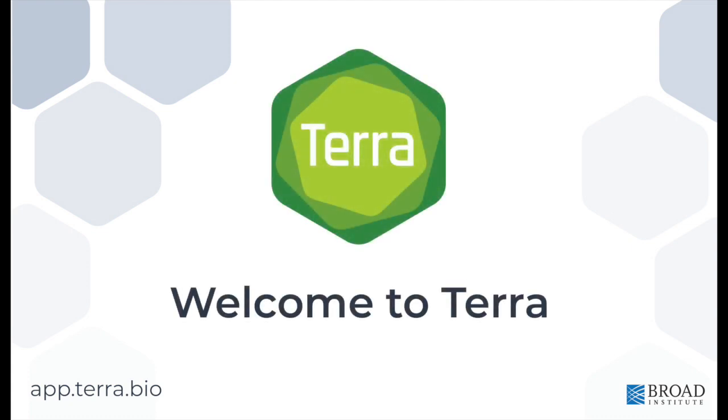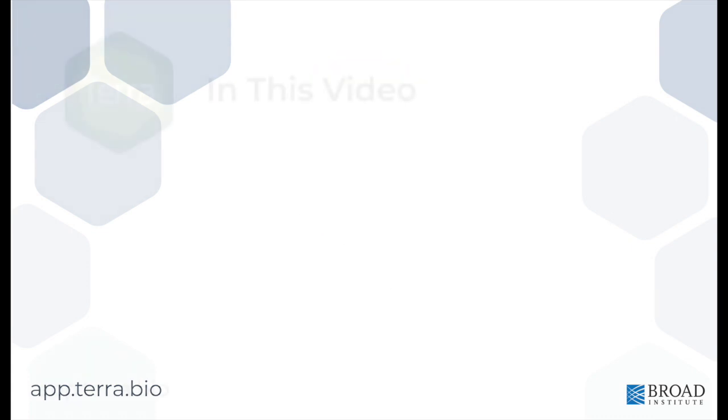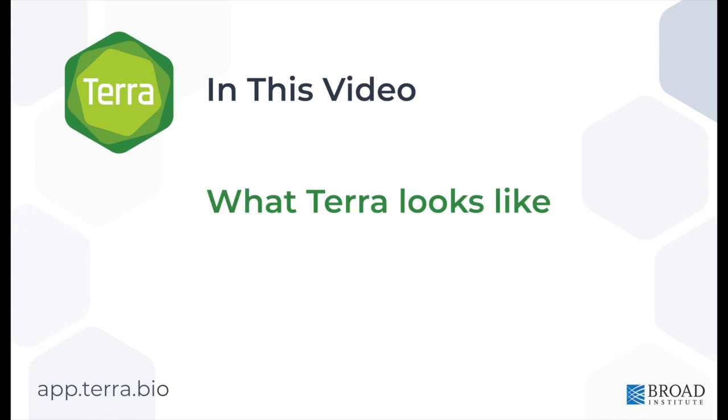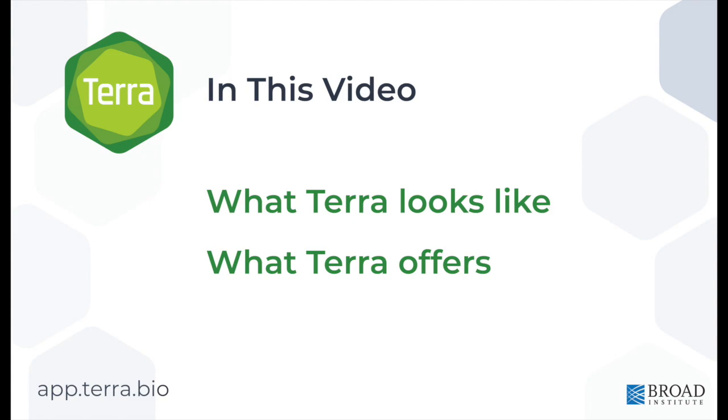Hello, I'm Derek from the Terra team. In this video, we'll be going over what the Terra website looks like and how you can use Terra as a part of your data analysis pipeline.